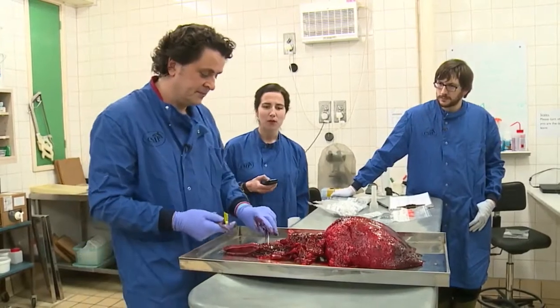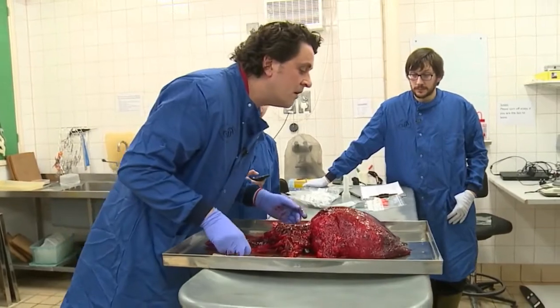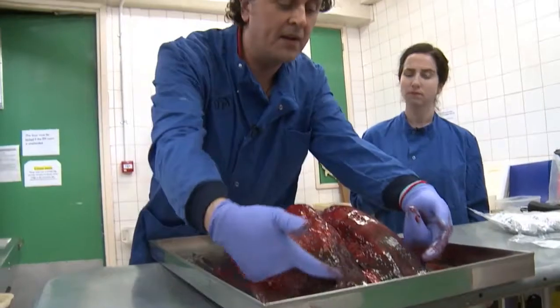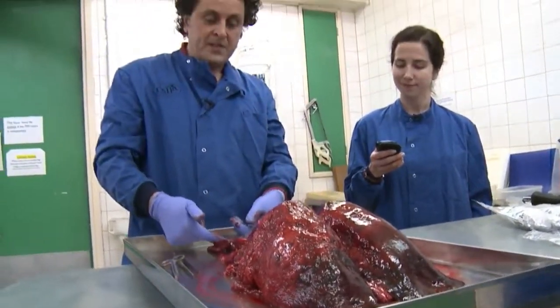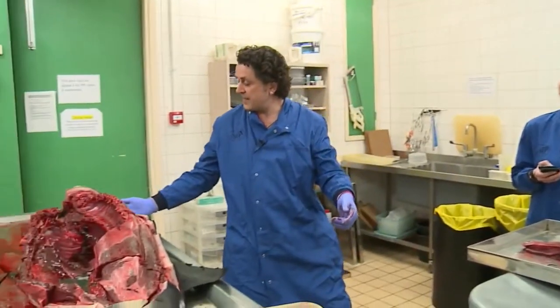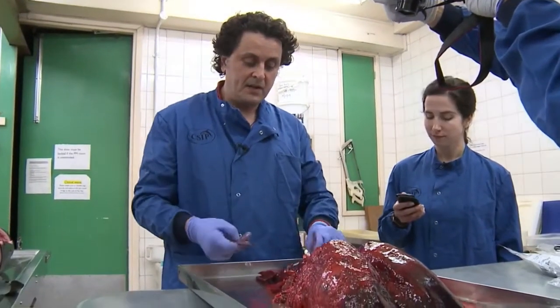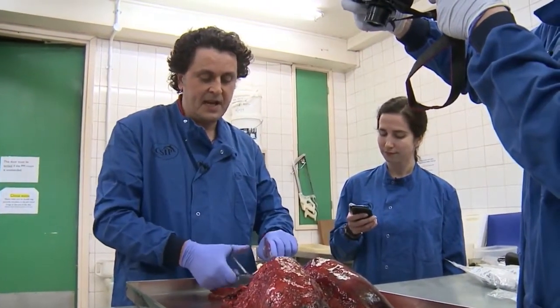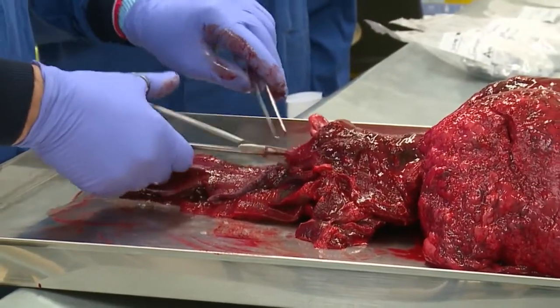Fantastic, okay. Well, what have you got here in front of us? Okay, so we've got the lungs, which are a little bit darker and congested, so darker red at the bottom half, a little bit paler over here. And then running up, we've got the tongue and then the larynx. So these are breath hole divers. The larynx fits into the entrance of the blowhole and they breathe through the top of the head. So we're going to start by going down into what we call the oropharynx, which is this area around the larynx, really. And if we had more time, we could also talk about how they echolocate.